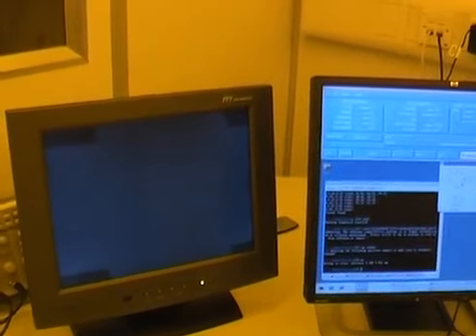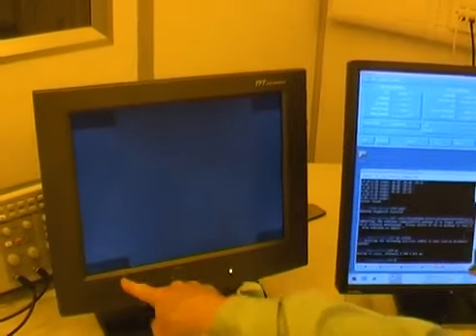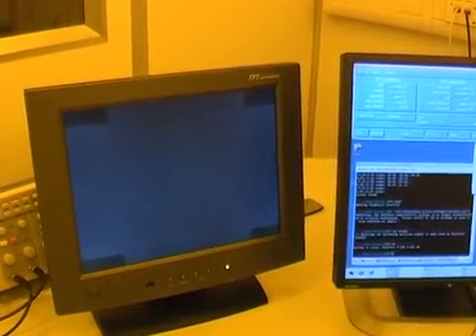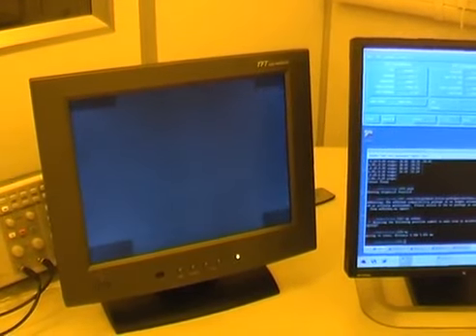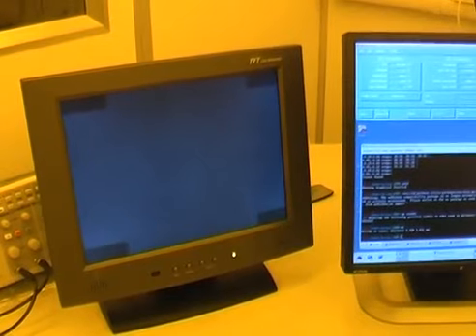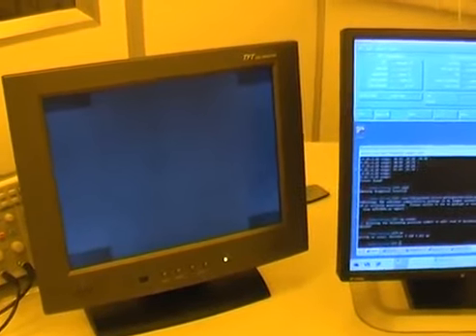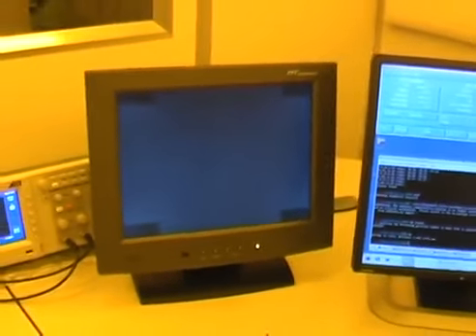For a cross like this, it's sometimes easier just to look at these 4 corners and try and get those as equal as possible. And that will do. So we've now moved to the centre of the cross as far as we can say.